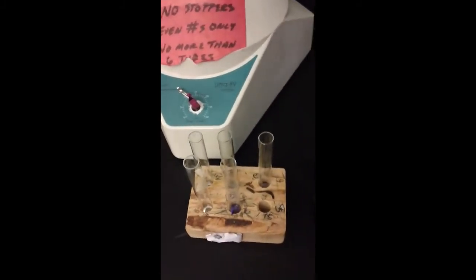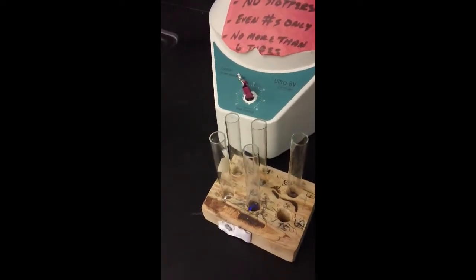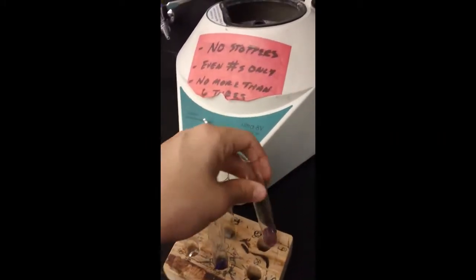Alright, so now we're done centrifuging, and if we look at our directions here, we want to record our results, and we're looking to see if there's a solid. Okay, and we're recording our results. So I'm going to walk you through, and now you're writing in your data table, and we're on test B for each chemical. So we have our Cr.